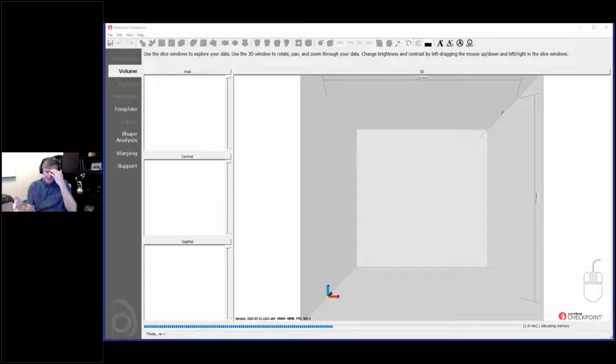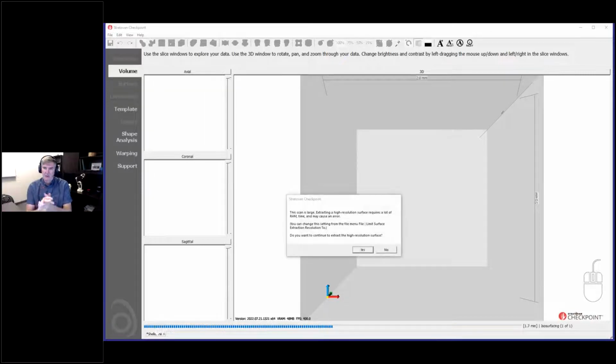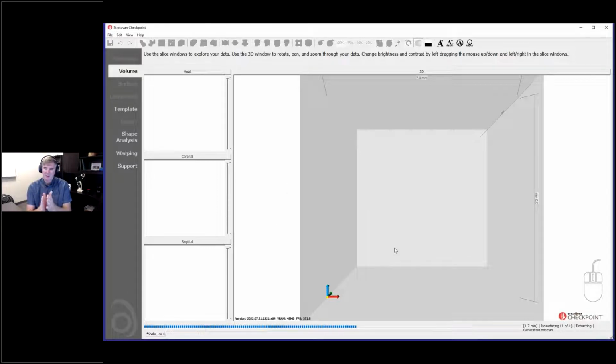Typically, the vendor of the scanner provides reconstruction software to do the 3D reconstruction. They do the reconstruction in the slice planes, and that's why we end up with 1,000 TIFF images, because they're reconstructing each of those slice planes individually. And that's typically the output from a micro CT scanner, and that would be the input that comes into Checkpoint, that fully 3D reconstructed scan.